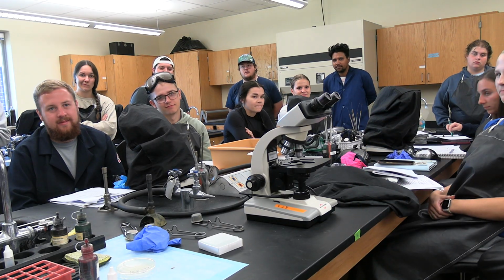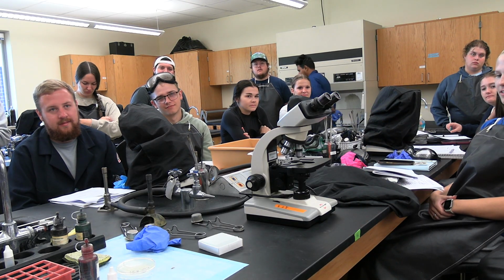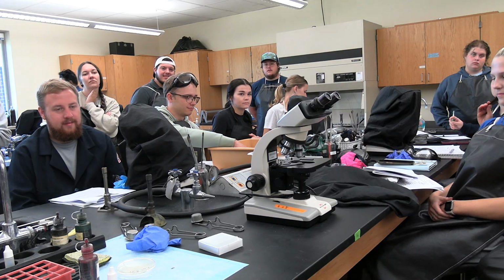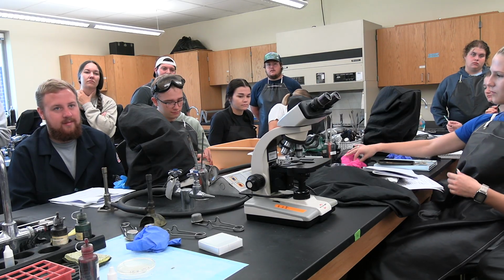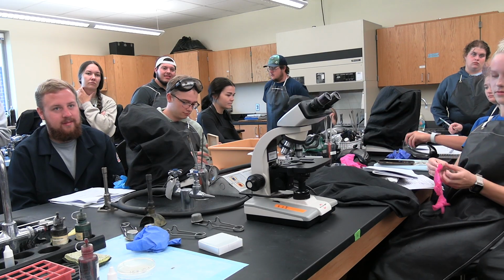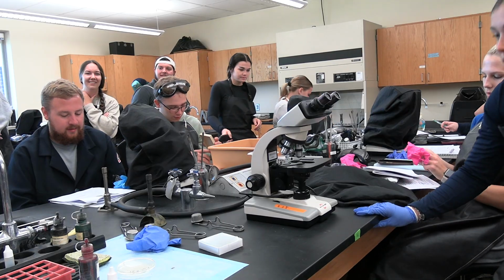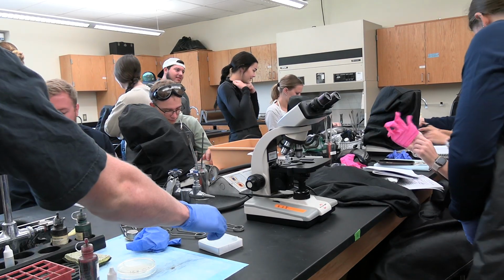So today's work is very simple. Everybody grab one glass slide, share the plates and put the colony there. We do the simple stain. I hope you're going to do the same as I did. It's very short, 5 minutes you get it done. Okay, very good. Use your cell phone, take the picture. You can get a big good picture.